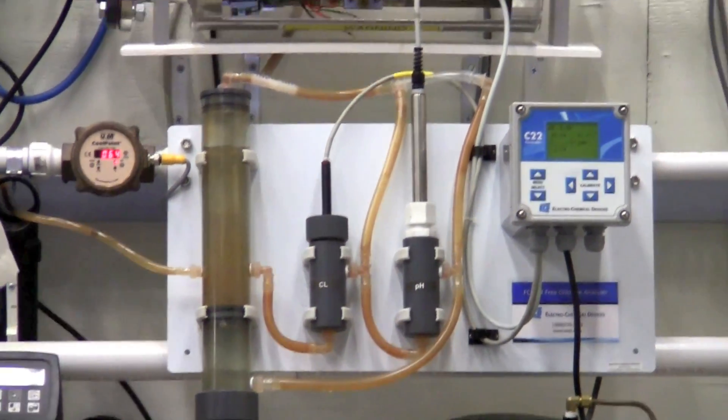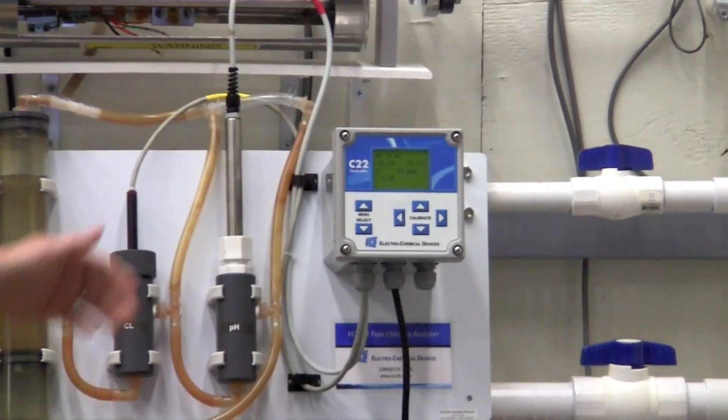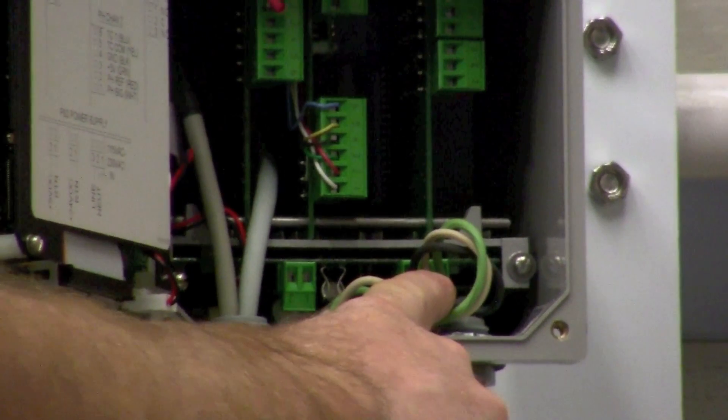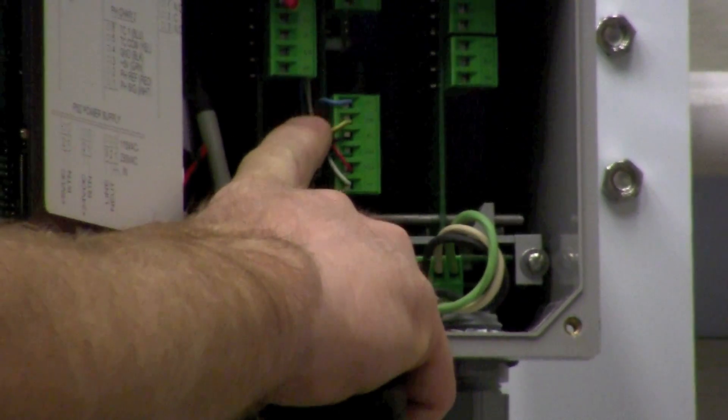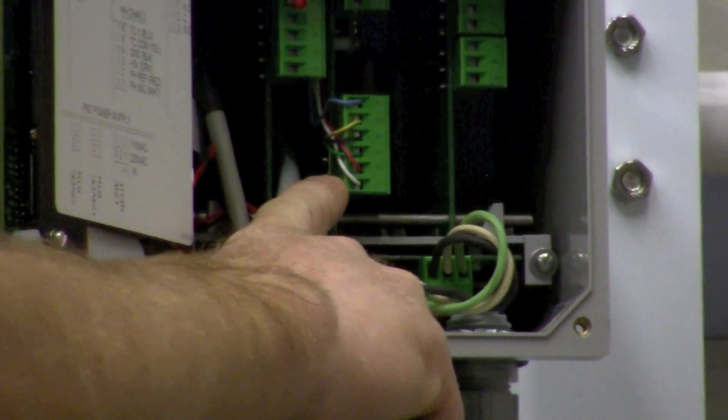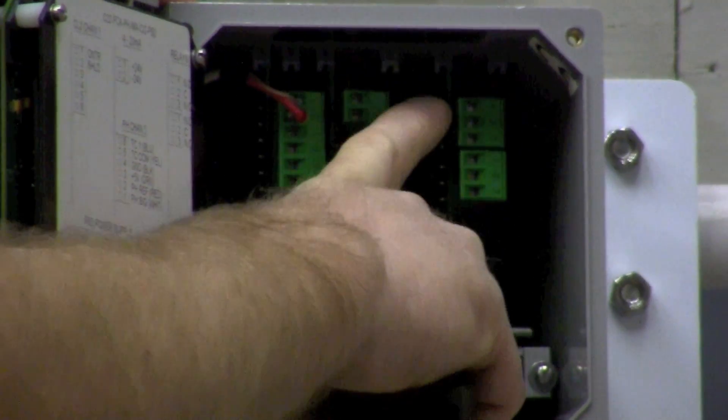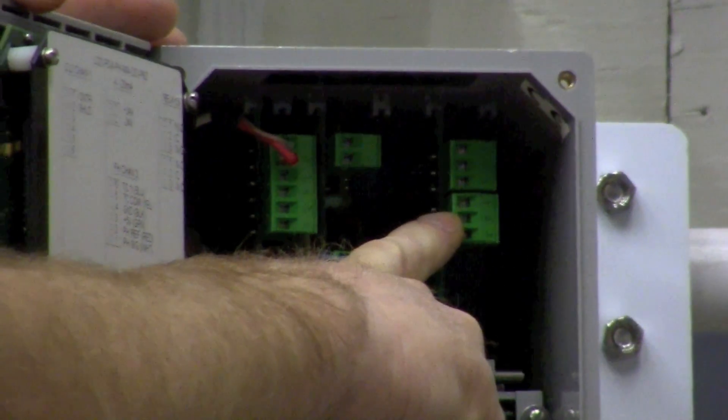The wiring of the system 22 is as easy as connecting the 110 volt power to the terminal block. We've got a pH sensor that's wired into this terminal block, chlorine sensor up here. We've got one 4 to 20 output and we've got two relay contacts.